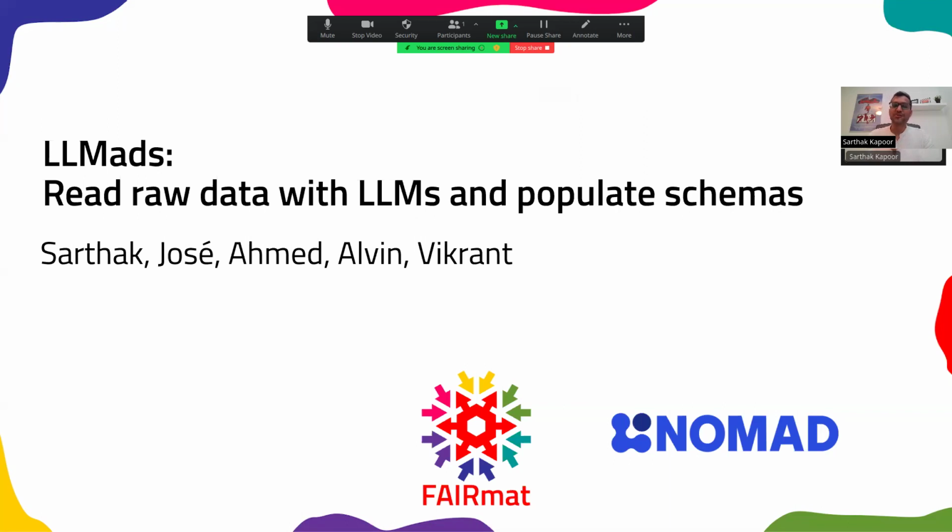During the hackathon, we worked on the topic of reading raw data using LLMs and using their output to populate schemas. For us, the raw data came from XRD measurements.